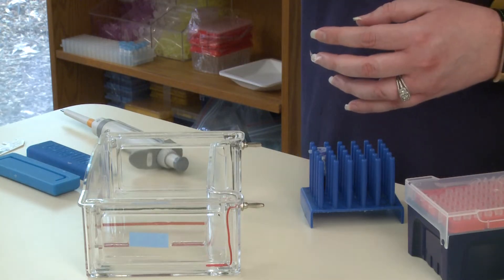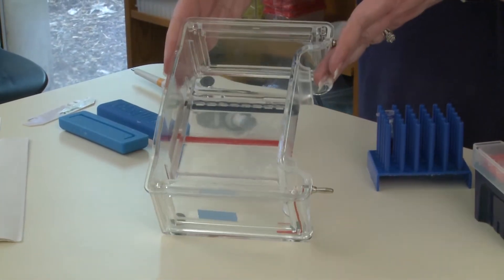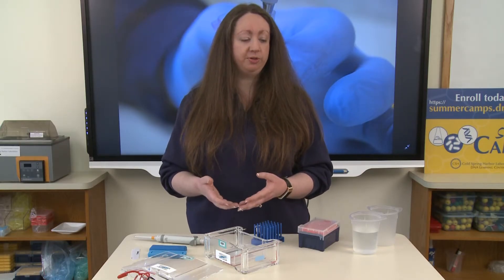To place your casting tray inside of your gel box, just grasp it on either side and place it in the center. So now it is inside of your gel box. We're going to be running an electric current through here, which will help us to mobilize our DNA to move through the agarose gel.